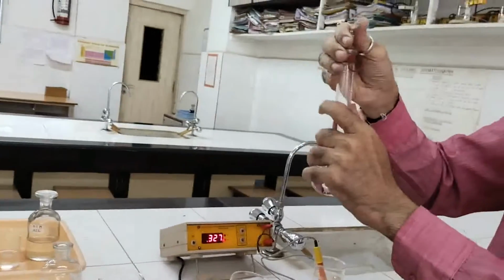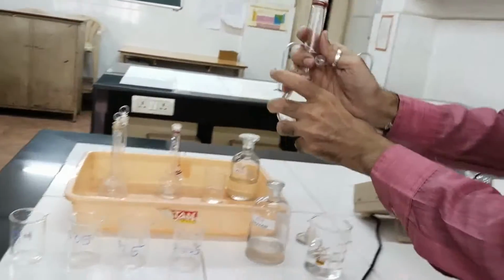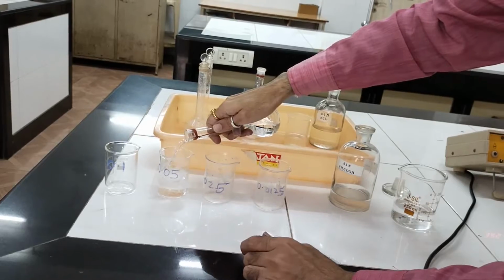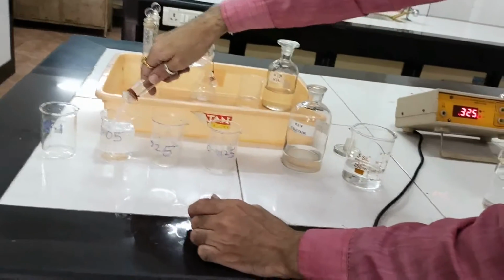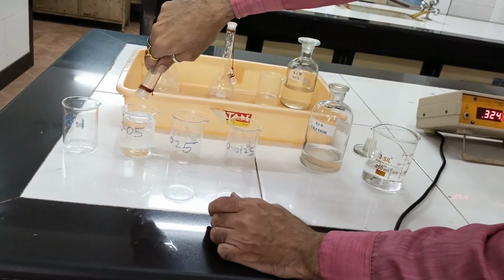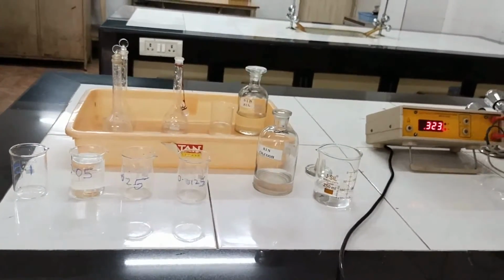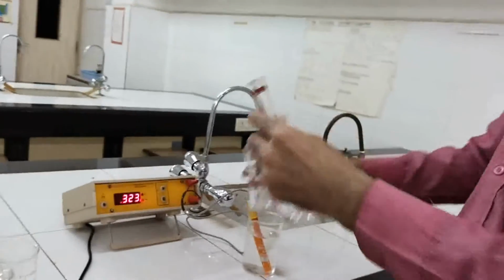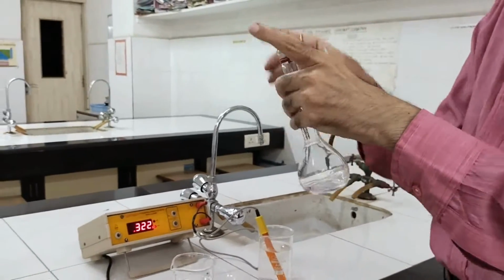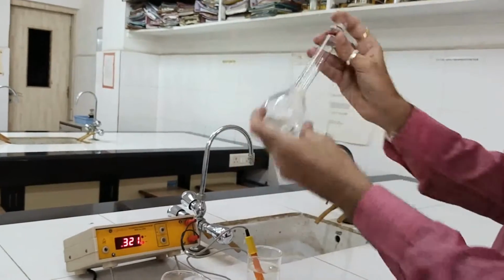So what I am going to do is, very slowly I am going to open this, and this entire solution will go into the beaker, which is labeled with 0.05. Okay, so this is the preparation of the first solution. I just rinse this with conductivity water. Make sure that you are using the same standard measuring flask, so that if at all there is an instrumental error, then it gets nullified.